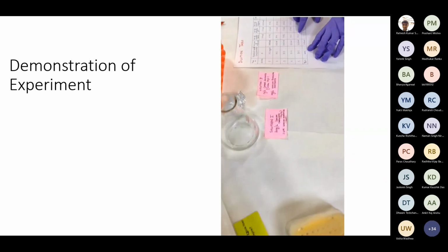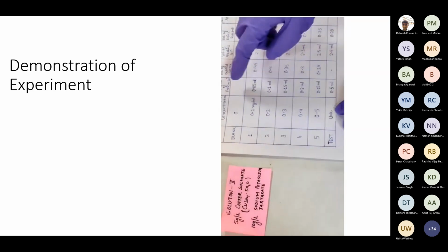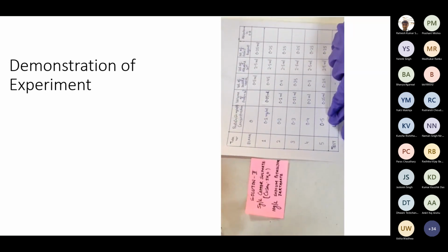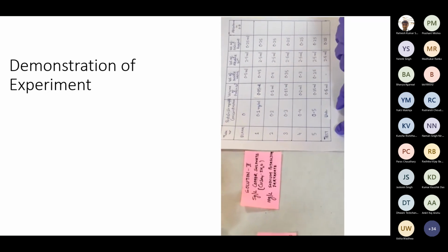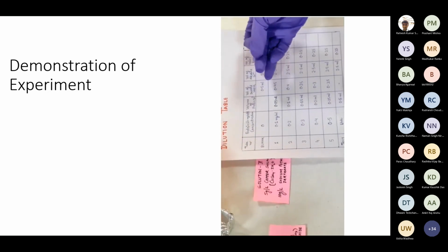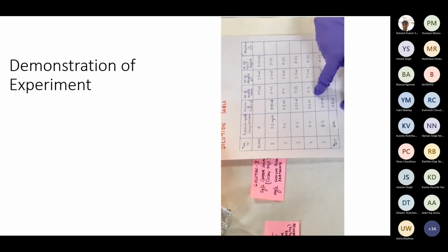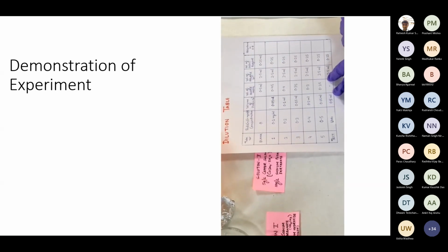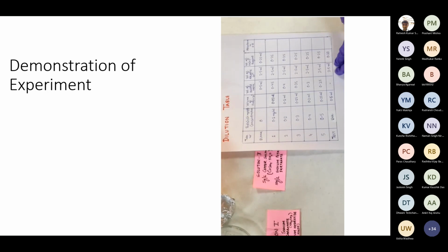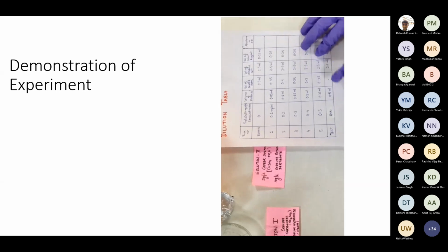As you can see, this is the dilution table. First, we have given different protein concentrations, with a blank and a test. Using these different concentrations, we'll prepare a standard graph and determine the concentration of the unknown sample. We prepare the different standards by taking different volumes of protein solution, that is the 1 mg per ml stock that we have, and adding the corresponding volume of distilled water, followed by addition of the alkaline solution that we have just prepared, and then we will add Folin's reagent.